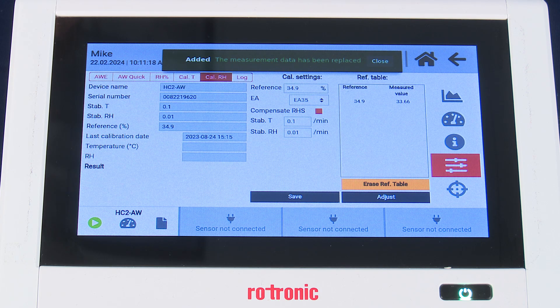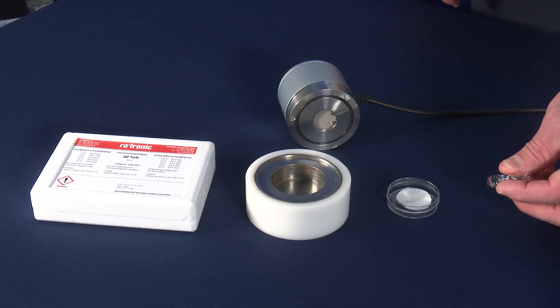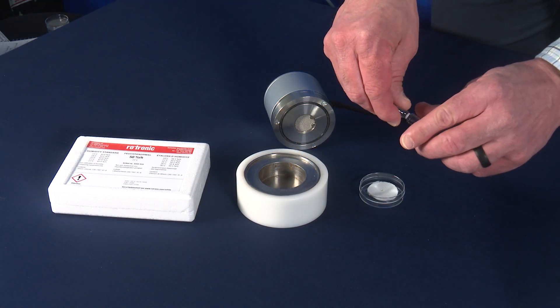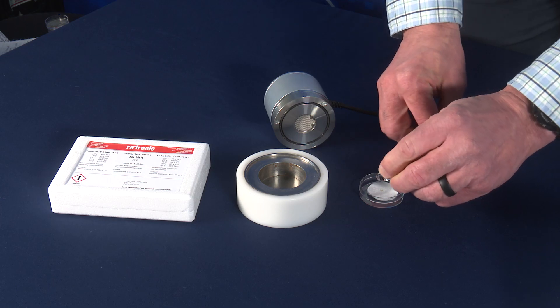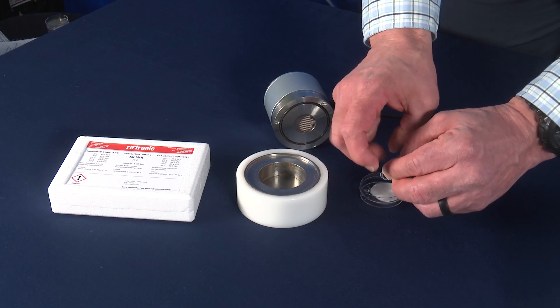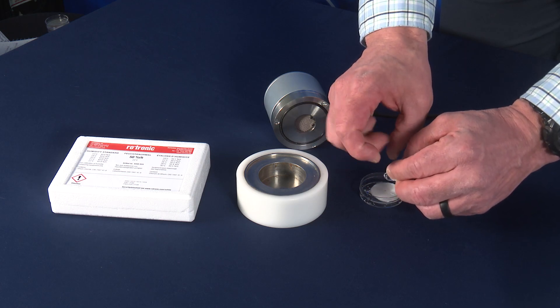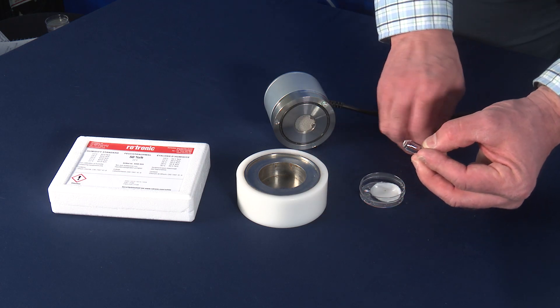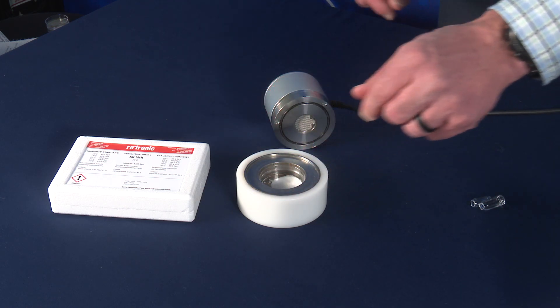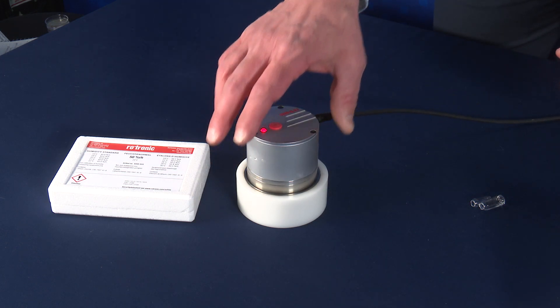We'll enter a new measurement point, and you can see that we've successfully added it. So now we want to move to our second adjustment point — in this case we've selected 50% RH. Again, tapping the vial, breaking carefully at the perforation, emptying the contents onto a new fiber disc pad, carefully discarding the glass ampule, placing the sample cup into the sample cup holder, and putting your Rotronic Water Activity Probe on top.